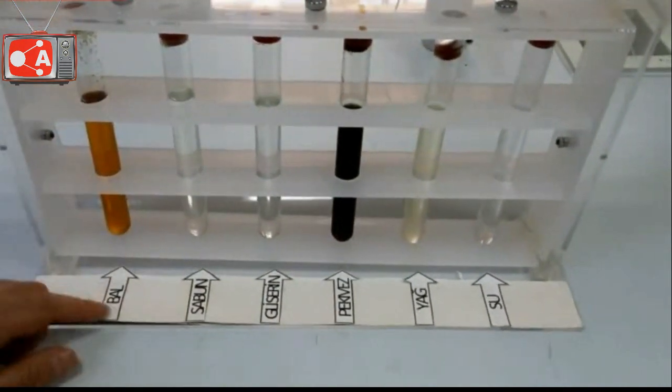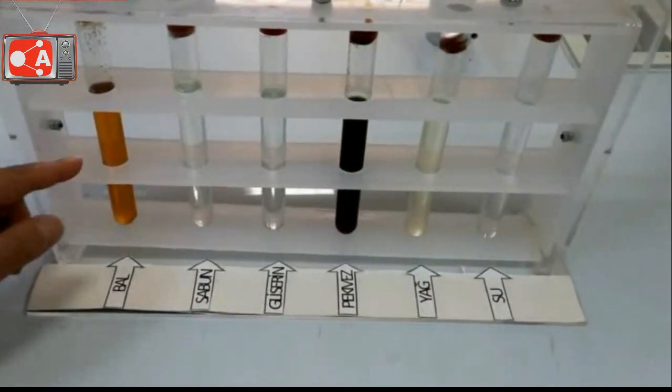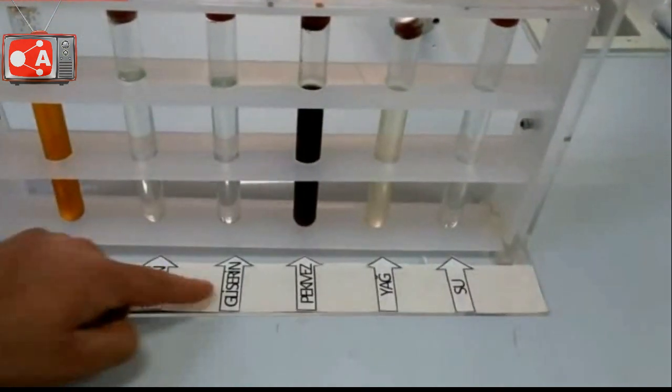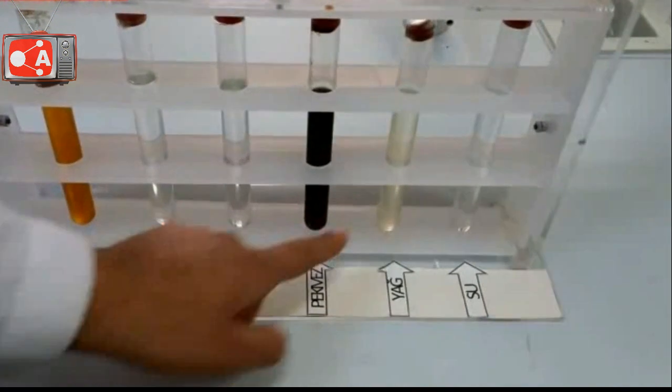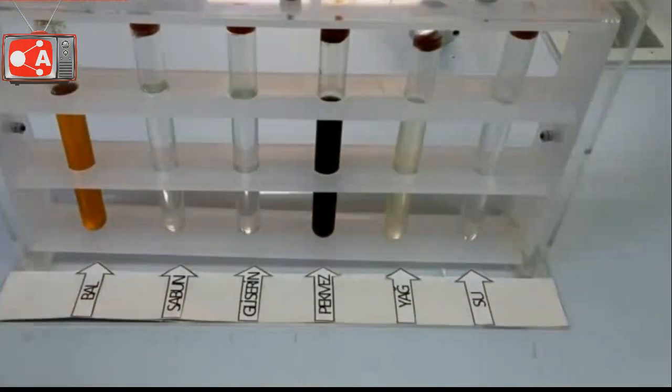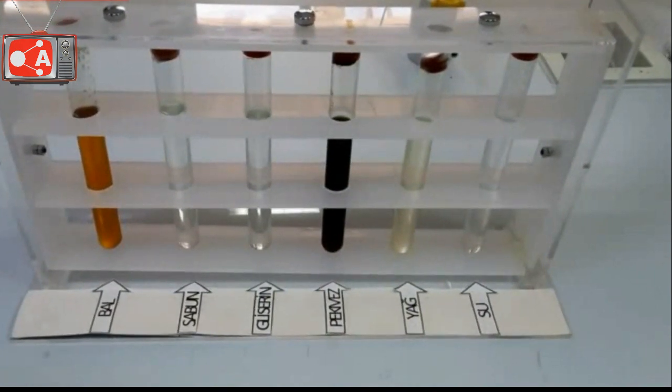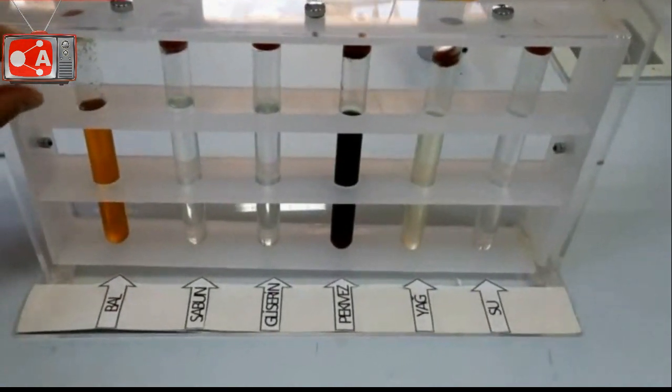We will compare the viscosity of different substances in liquid form in this experiment. We get 6 test tubes and we add different substances such as honey, liquid soap, glycerin, peck mass, water and oil.